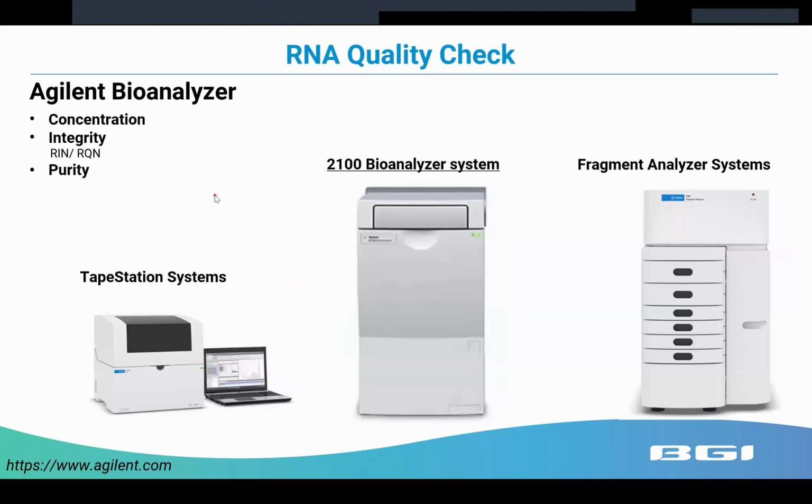Then the Agilent Bioanalyzer is widely recognized as a gold standard for RNA quality check. There are many different types of the analyzer. Actually, they created the RIN value, which is short for the RNA Integrity Number. It is a crucial metric for assessing the quality of RNA samples. The RIN value counts from 0 to 10. The lower the score, the more degraded the RNA.